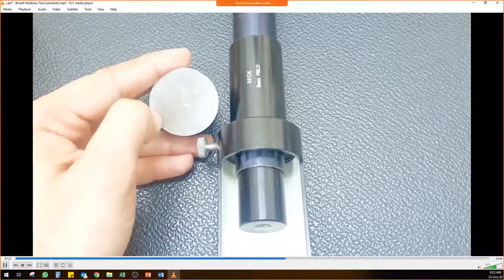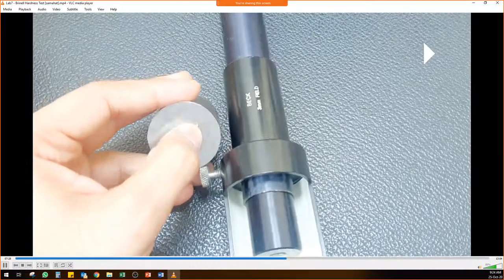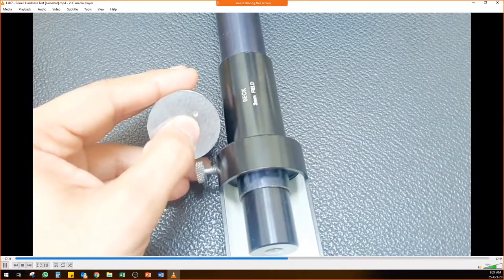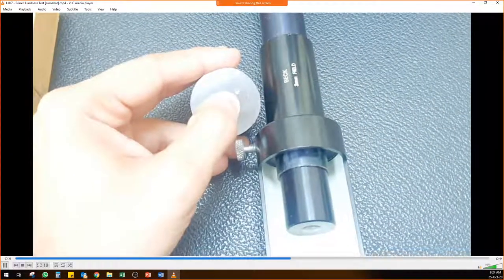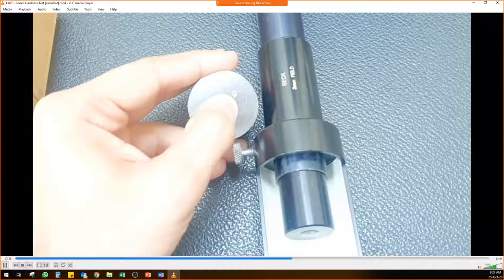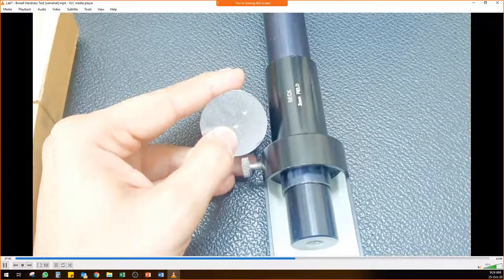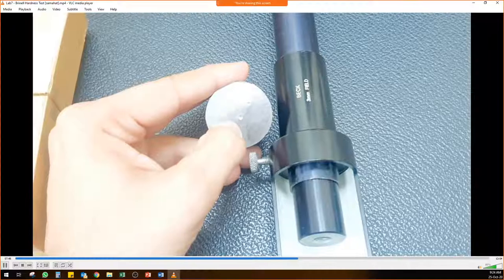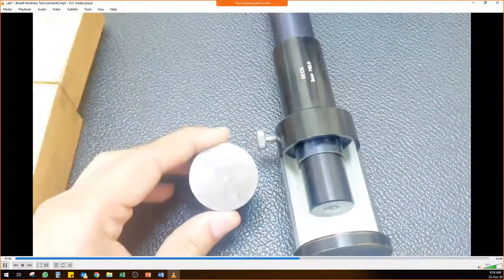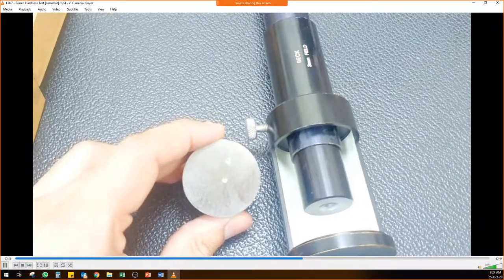Okay, using the microscope, I have done the measurement, and now I am telling you how much the size was. So remember this carefully. Of the first sample we have measured, for the first indentation mark, the measurement is coming out to be 2.1 millimeters, and for the second indentation we are getting the measurement as 2.05 millimeter. Okay, these are the two readings for the steel sample. We measured using the Brinell hardness testing method and using a 5 millimeter indenter.